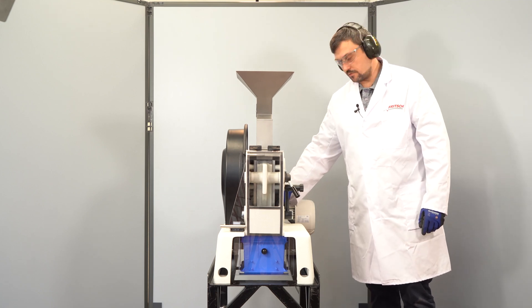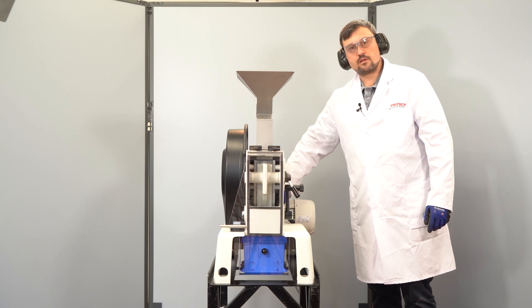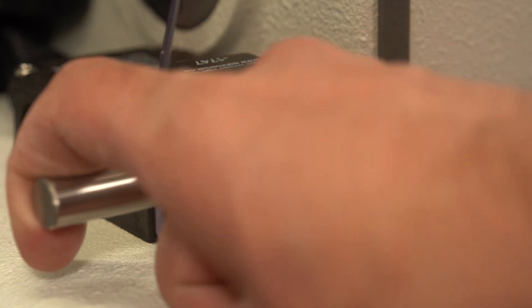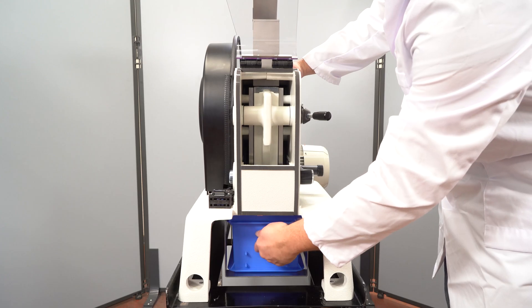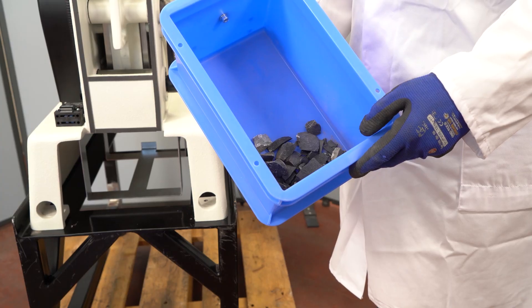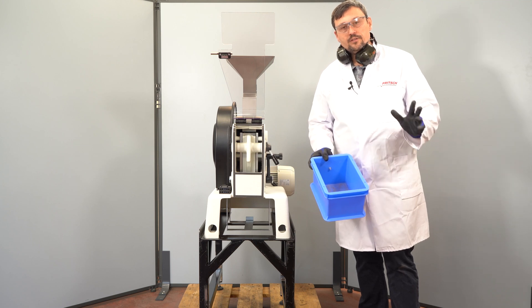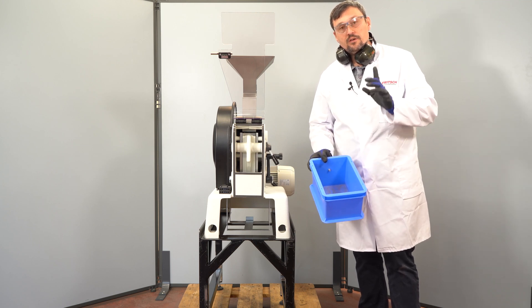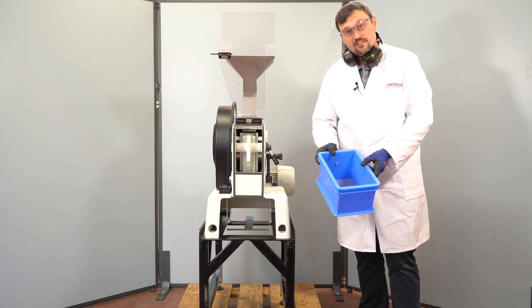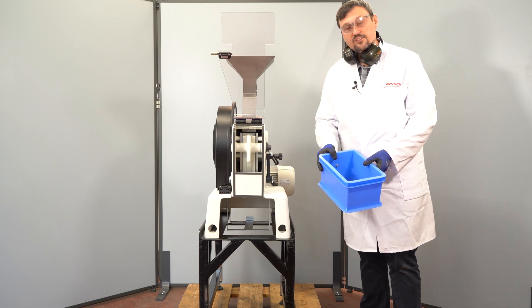Now we can turn off the instrument. Let's take a look inside — this was our pre-grinding step, which we always recommend. Never grind a sample on the smallest gap if not necessary. Next we will do a fine grinding with the smallest gap setting.